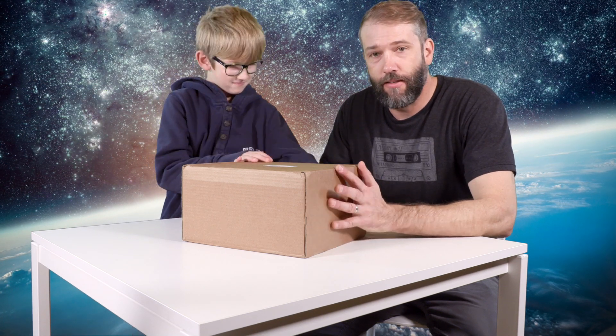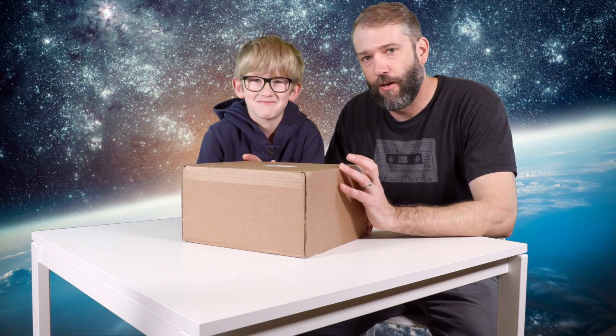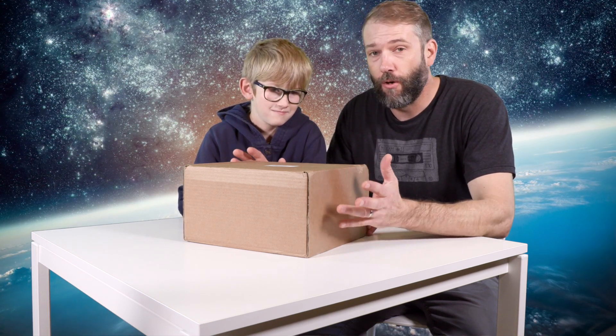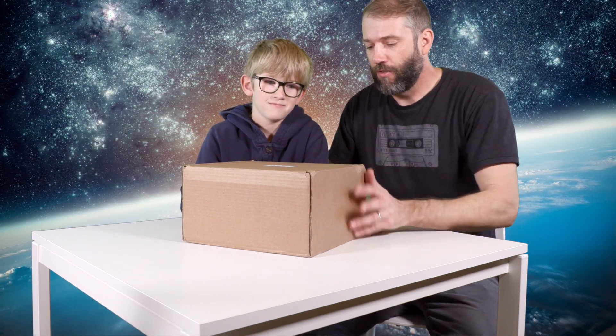Let's open it! This is the basic kit that they send you with a subscription box. We're going to open it up and show you what's inside, and then you can watch another video and we'll go through all the things inside. We'll go through one of the kits. Alright, let's open it up.